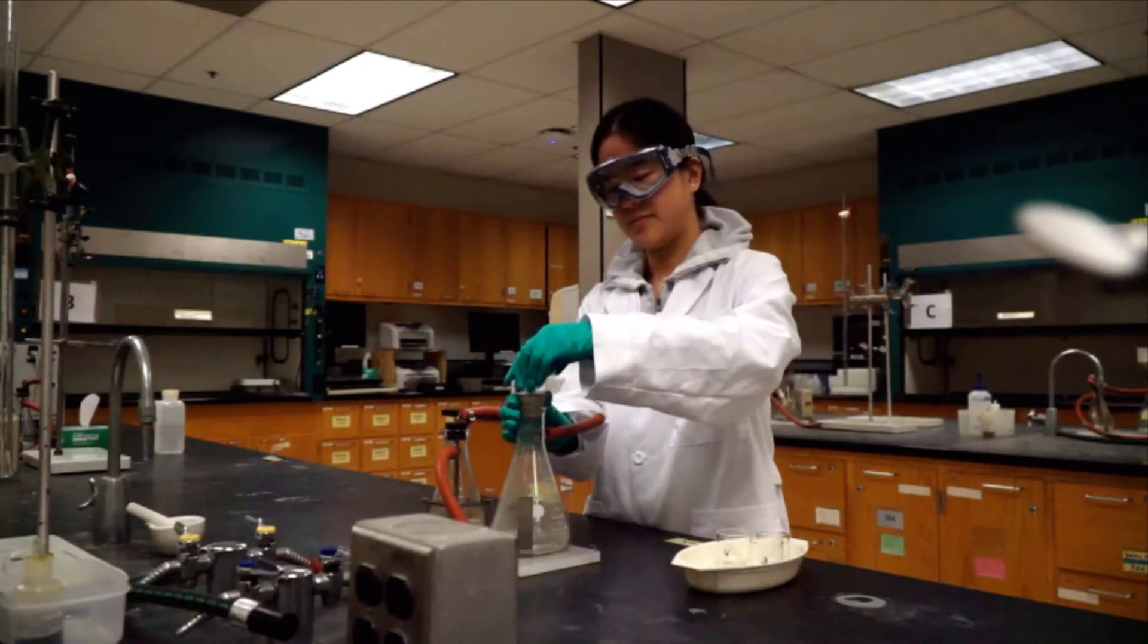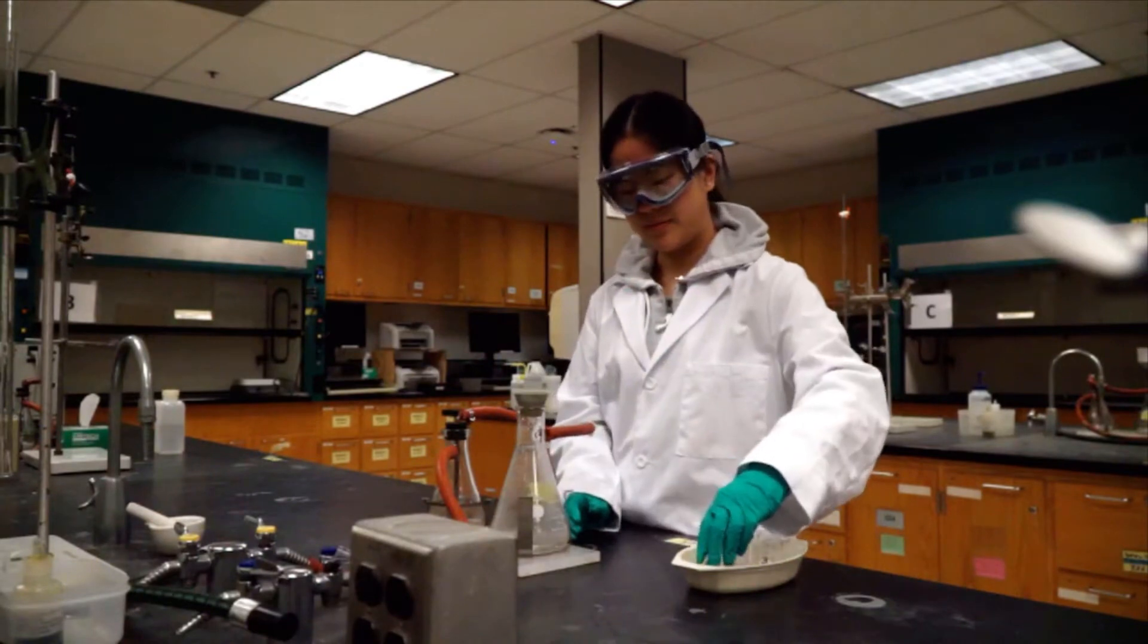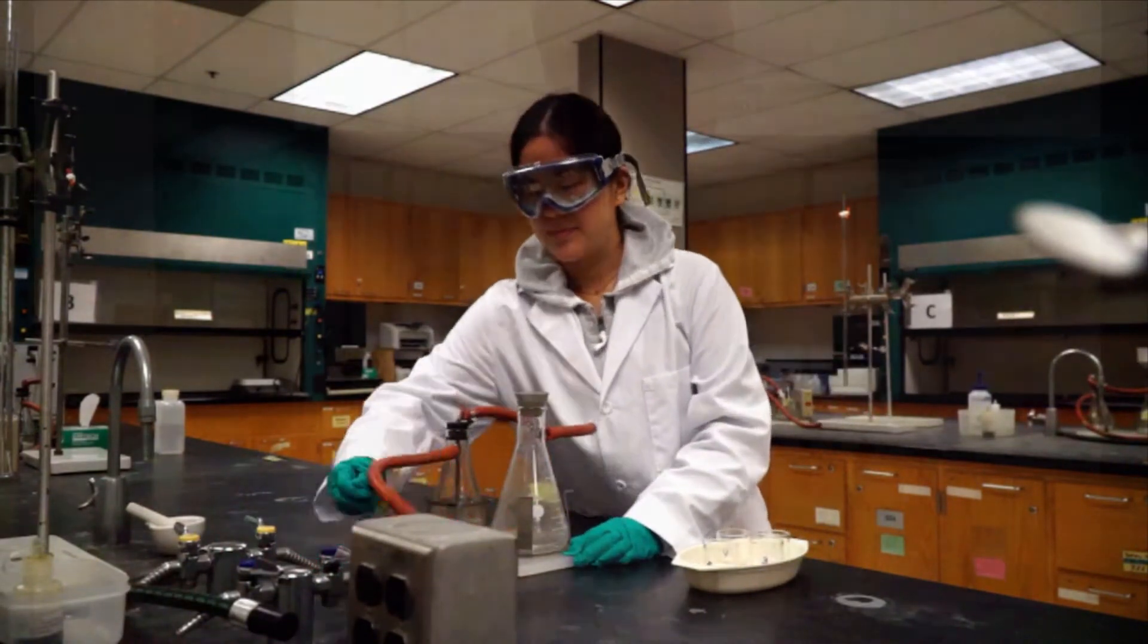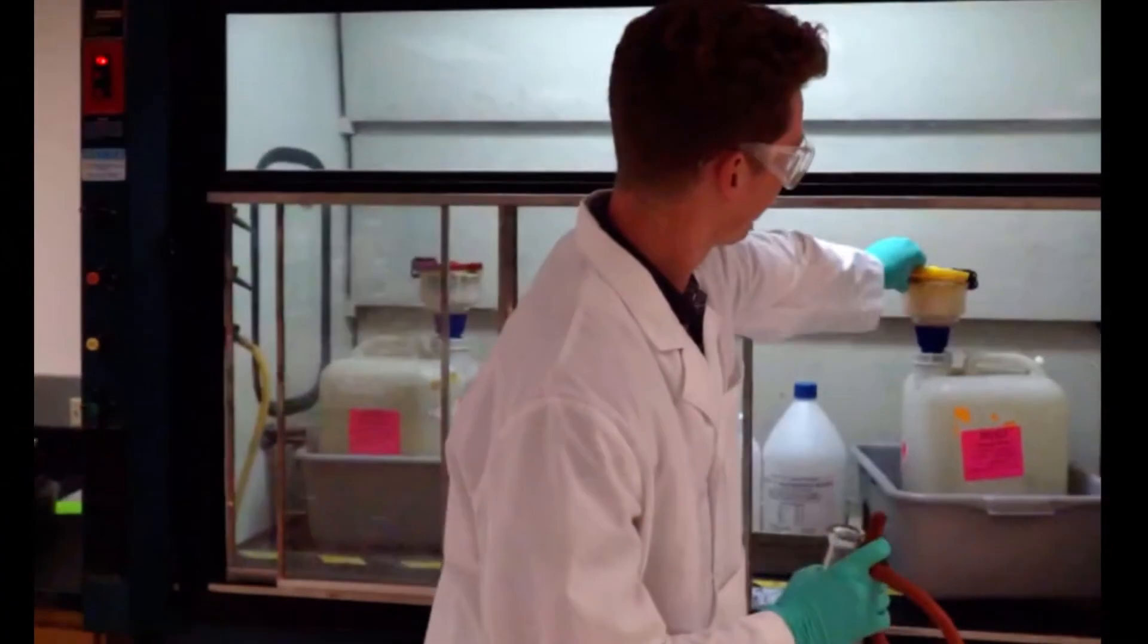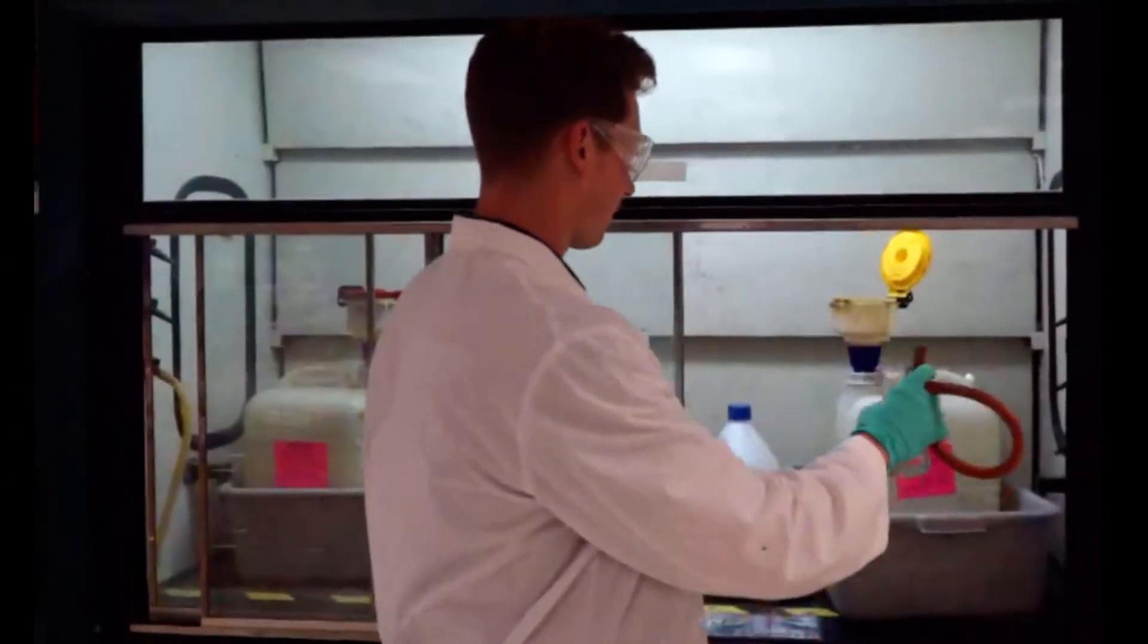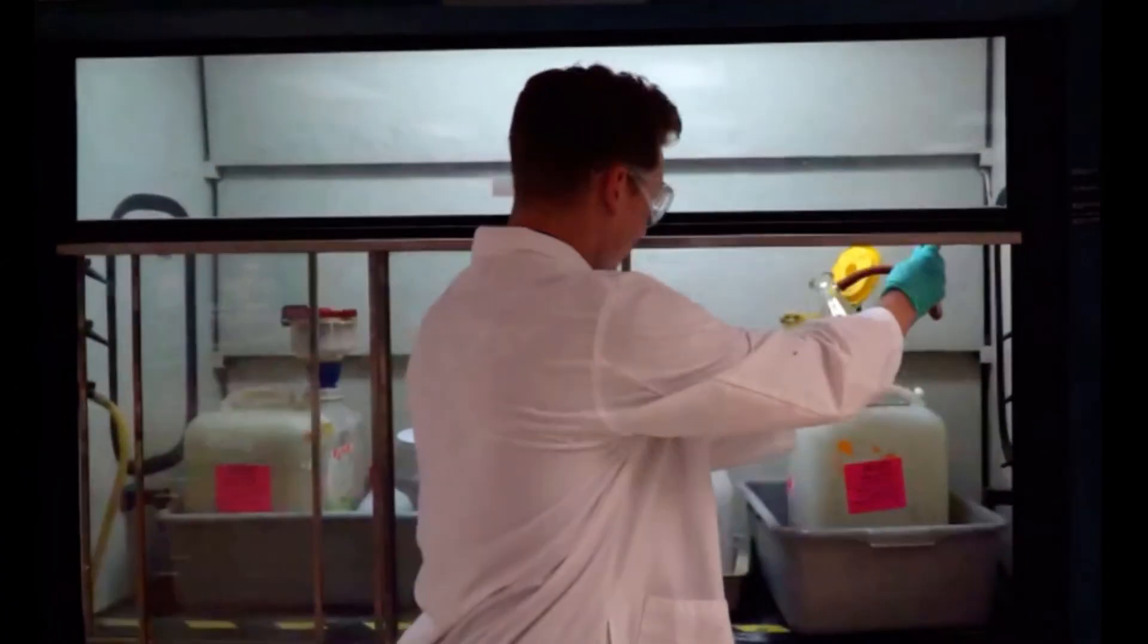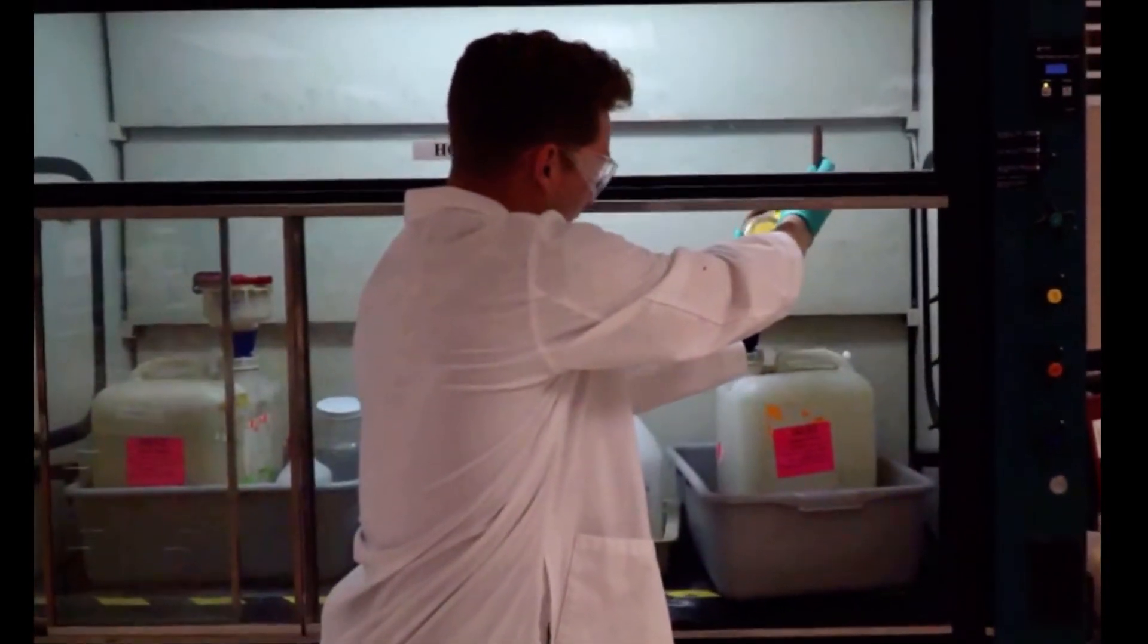When you're done filtering all four crucibles, don't forget to pull the hose off of the house vac nozzle. The proper way to dump liquids out of a filtration flask is to point the side nozzle upward, pouring the liquid out of the opposite side.